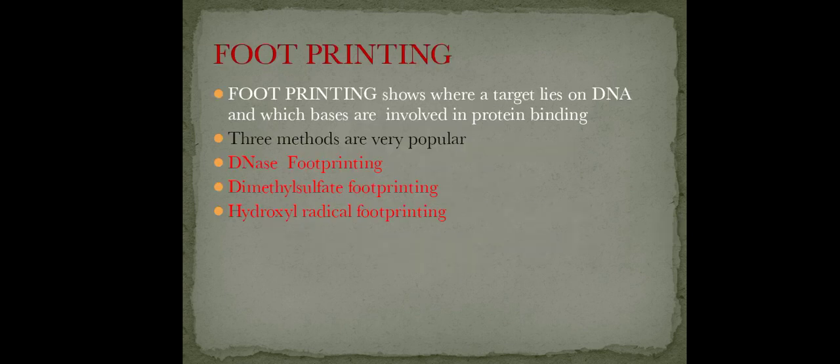Today we are discussing DNA footprinting. What is footprinting? Footprinting shows where a target lies on DNA and which bases are involved in protein binding. Three methods are very popular: DNase footprinting, dimethyl sulfate footprinting, and hydroxyl radical footprinting.